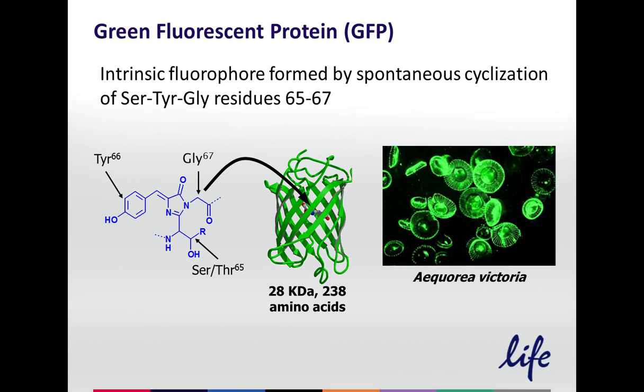Now, green fluorescent protein, the actual fluorescent part is the small molecule that's in the middle of this barrel structure, this tertiary structure. That barrel structure, to some extent, will protect it from the environment. It doesn't stop it from photo-bleaching, unfortunately. GFP photo-bleaches fairly quickly, as do many other fluorescent proteins that have come about since then. But if you try to use an anti-fade mounting medium on it, for instance, you're not going to have much luck because the anti-fade components aren't able to get into that barrel structure. Here's a picture of the jellyfish fluorescing, by the way. Quite beautiful.